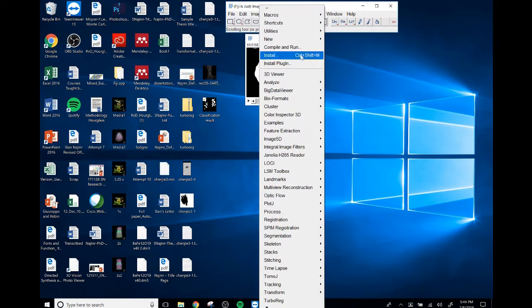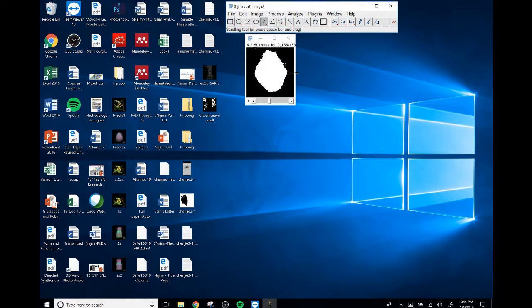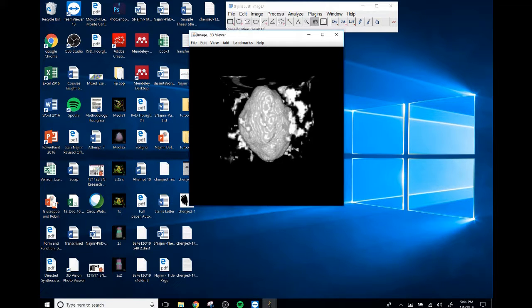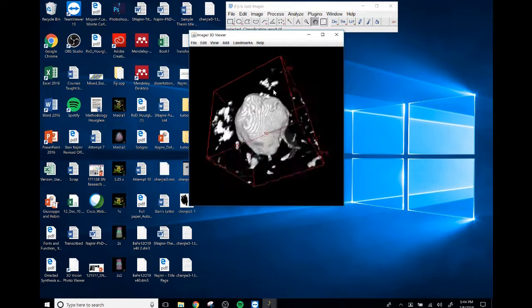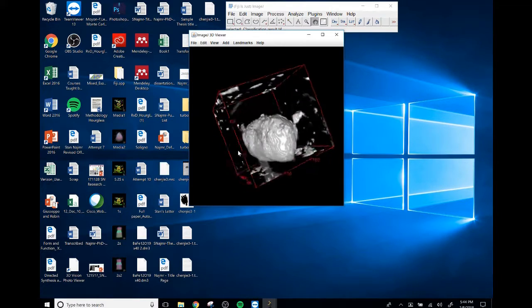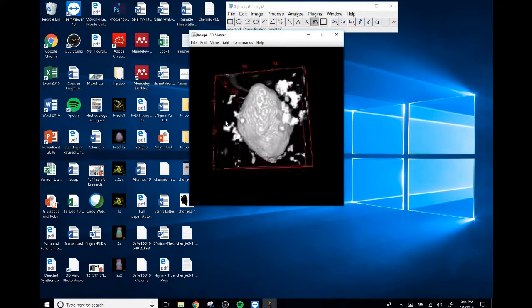What we're going to do is load this into 3D viewer, which, by golly, I hope works. Okay, so we're going to do this. Say okay, and there's the particle. Bada bing, bada boom. It's done. So you can see there's some areas of back projection that are appearing.